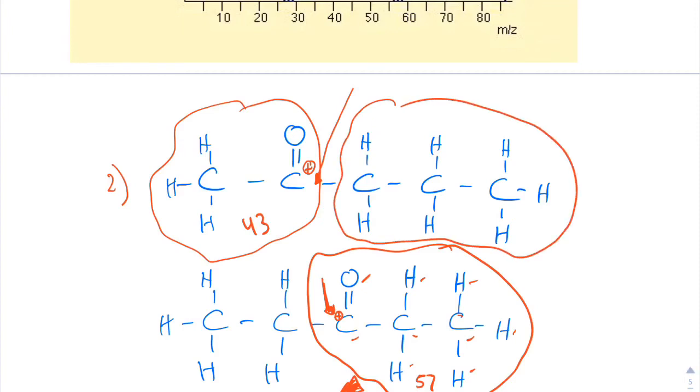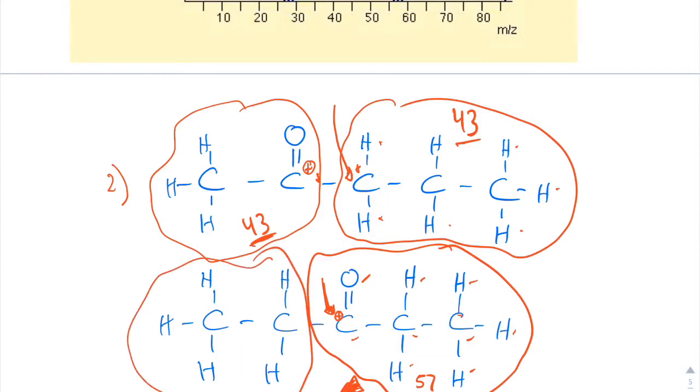So what if my electron went in and it hit over here, and this was the positive, right? That would fly through. So 12 times 3 is 36, 37, 38, 39, 40, 41, 42, 43. So this one would weigh 43, which is the same as this 43. So I'm expecting 43 to be pretty popular over here. And then maybe this fragment here, this one would be, let's see, 24, 25, 26, 27, 28, 29. This one would be 29.